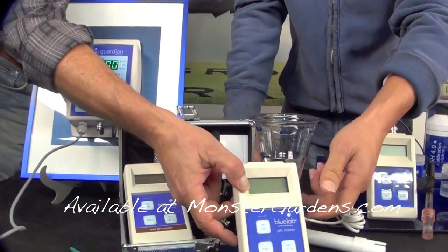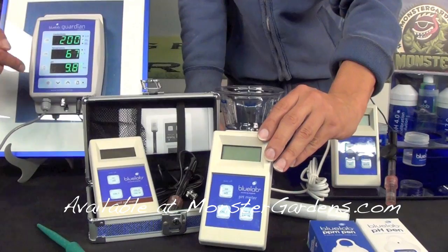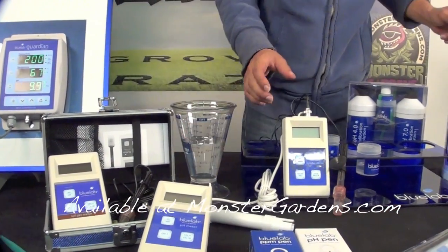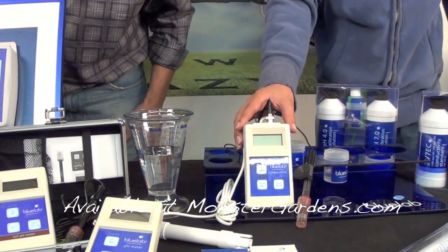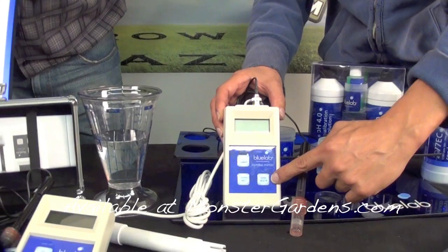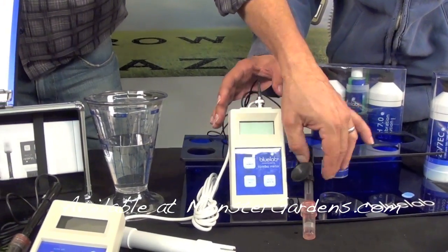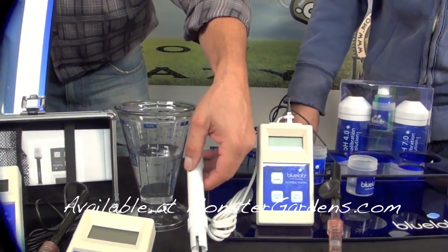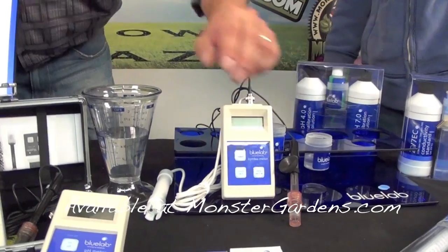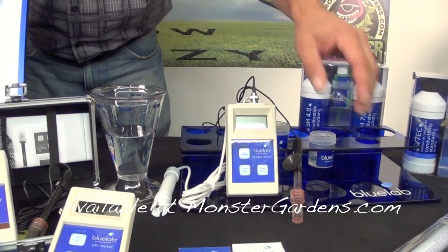This is our pH meter — same thing, four minutes and it turns off, very easy to calibrate like I showed you with the Guardian. This is our combo meter, probably our most popular meter. It gives pH, PPM, nutrient count, and temperature, which is very important. It has the pH probe on one side and the EC probe on the other. It's like the Guardian, just without the parameter sets and the alarm.